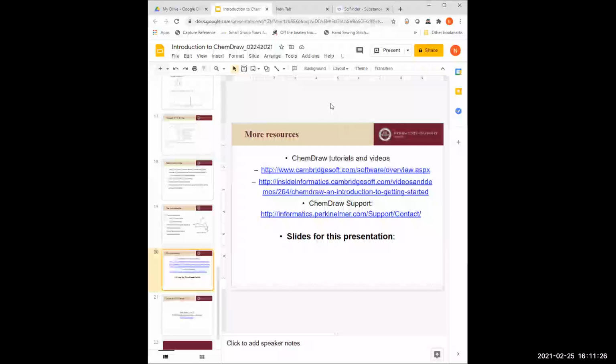All right, so that is all that I had today. So I hope that gave you a nice overview of the features of ChemDraw, a nice introduction to some powerful predictive tools, and showed you the interface between ChemDraw and SciFinder, so that you can do chemical structure searches based on something that you're drawing in ChemDraw, which is a really nice feature that they've introduced in the last few years as the products are more and more becoming connected.